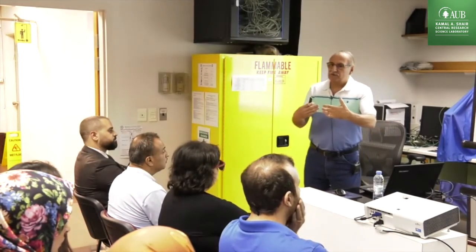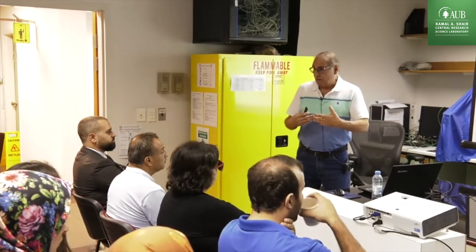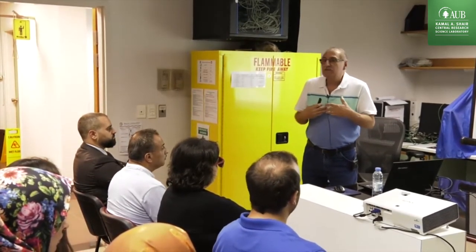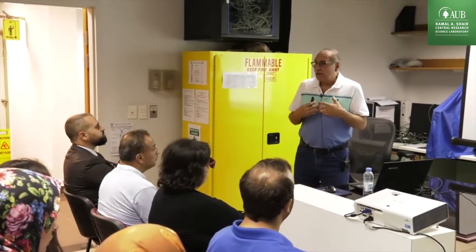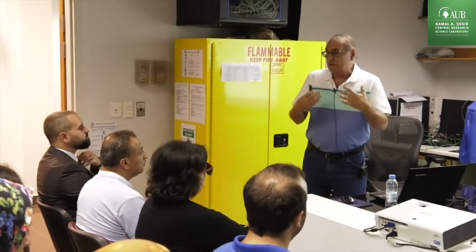I look to see, for example, at samples A, B, C, and D: which one can adsorb more CO, meaning it has more active species accessible on the surface. This is very important for us. I don't care if there are 5, 8, or 10. What I care about is how much is adsorbing, whether it is adsorbing or not adsorbing.